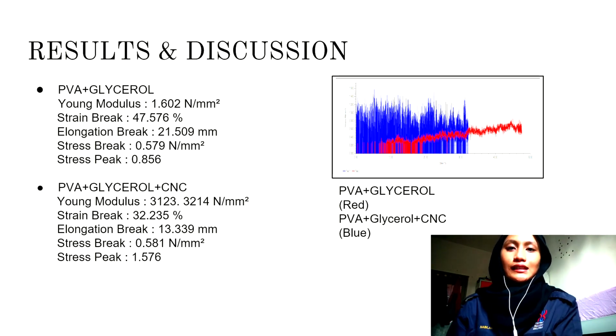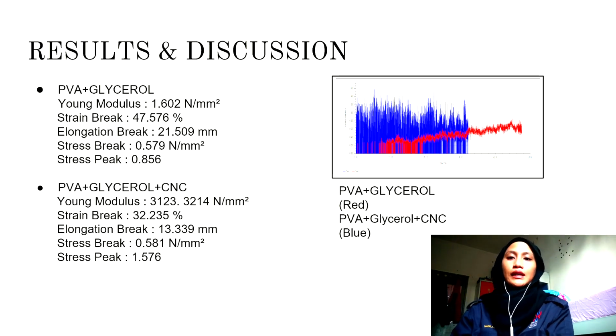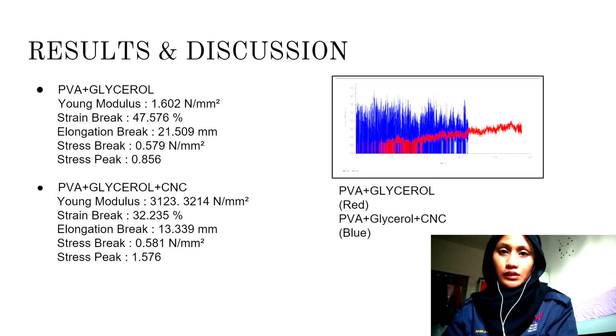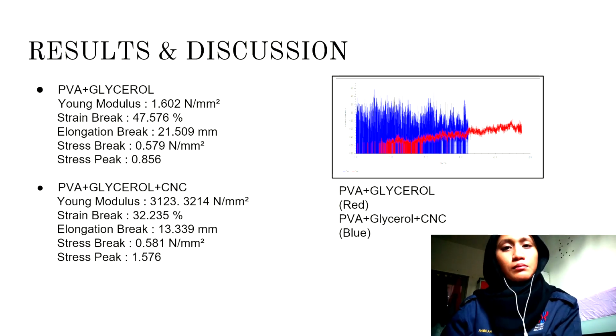Okay, as for the tensile elongation, it is the stretching that a material undergoes as it is put in tension. So it is used in conjunction with stress and strain values to help determine the mechanical properties of a material when performing tensile tests. A high tensile elongation is indicative of a soft and ductile material, but if its tensile elongation is nearly zero, then the material is most likely hard and extremely brittle.